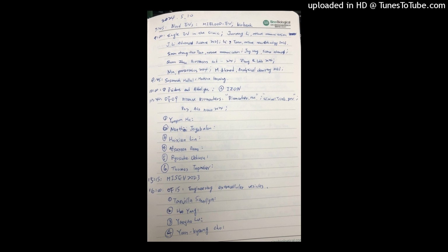Here's the density gradient. There was a paper in 2015, I believe, by Edward Lewis et al. describing this method, so we followed his example. This was still at Oxford, I moved to Monash later, but we'll come to that. One of the problems we found is that when you use these gradients, for most other methods that we've tried, we end up with very pure amounts of nothing, so there's almost never enough to do any downstream analysis like proteomics or looking for different biomarkers.